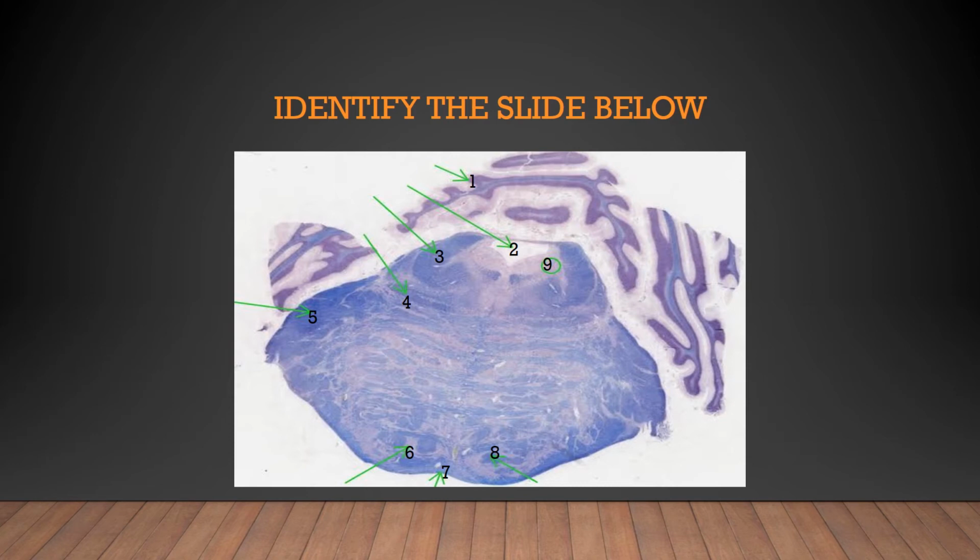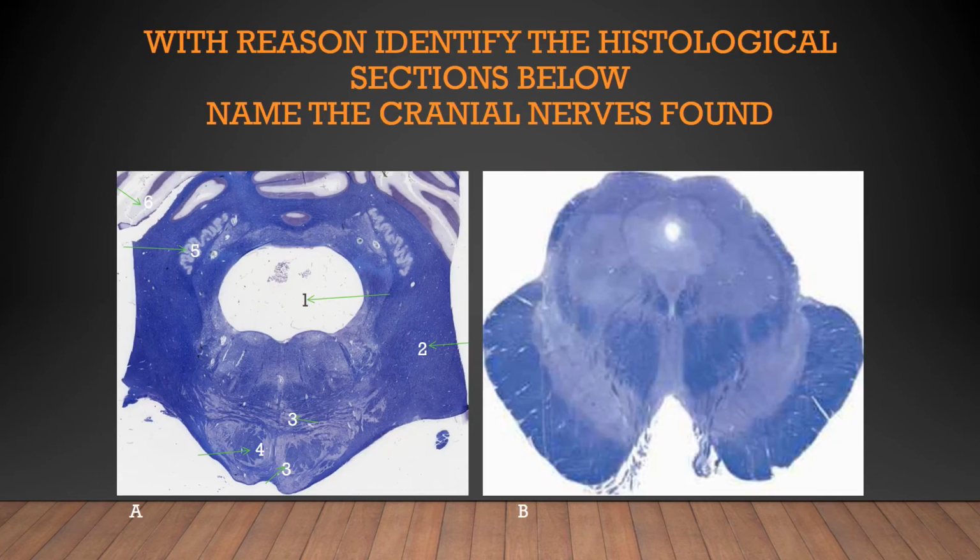I don't think you'll be asked about that, but so this is the slide of the pons.